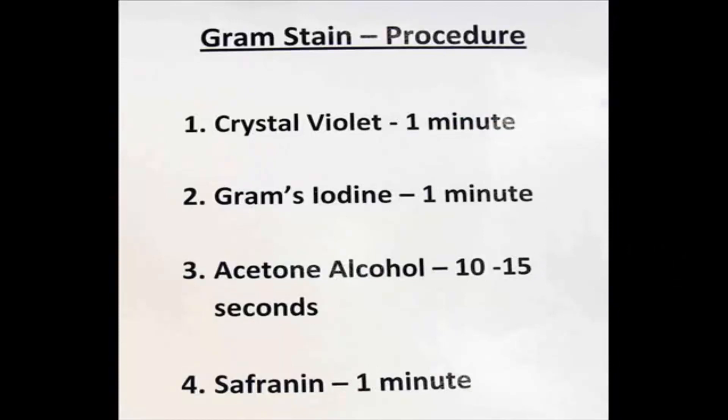My first step will be to apply crystal violet to the slide. That's my primary stain. It's purple. I leave that on for one minute and then I rinse.